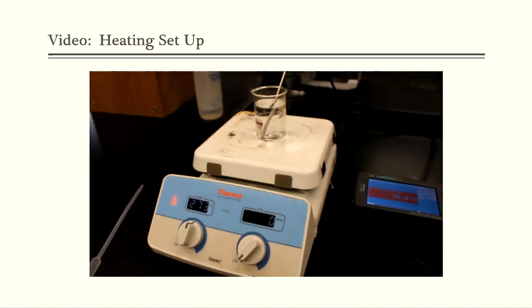All right, so the next slide here is a video. I'm going to play this video. It's going to show you the setup of the hot plate. So that way you have a video and visual of everything that's going on as far as the hot plate, the LabQuest, and the temperature probe is concerned. So let me play that for you, and that way you can hear my description and you can kind of see what's going on at this particular moment in time.